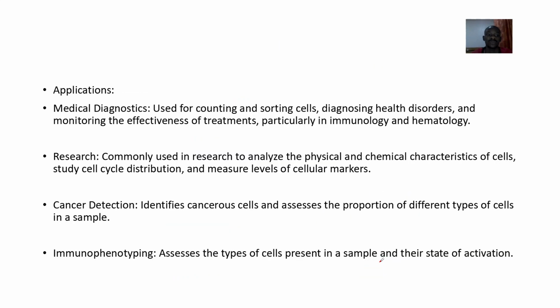Applications: in medical diagnostics, it's used for counting and sorting cells, diagnosis of health disorders like Fanconi anemia, and monitoring the effectiveness of treatments, particularly in immunology and hematology. Immunology is basically the study of your immune system, trying to see if your immune system is still competent and all of that. Okay, I think basically that's it.